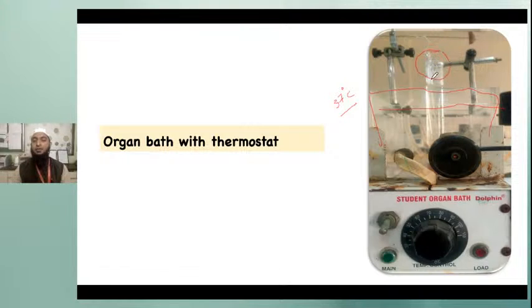Now the tube you see here is called the inner organ bath, which is made in different capacities from 15 ml to 20 ml. Why are you using this? You remove the tissue, and that tissue is mounted on the oxygen tube that I will show you in the next slide. After mounting on the oxygen tube, you can simply immerse that oxygen tube along with the tissue in this organ bath. In the internal tissue organ bath, remember that you are not adding water.